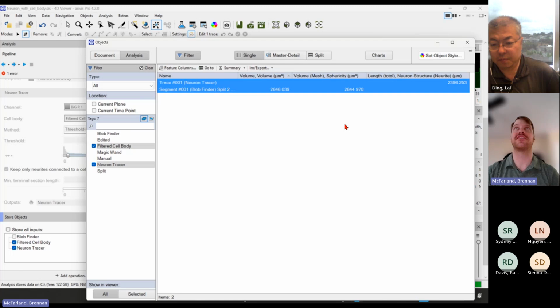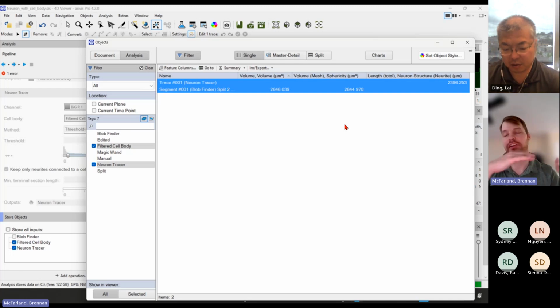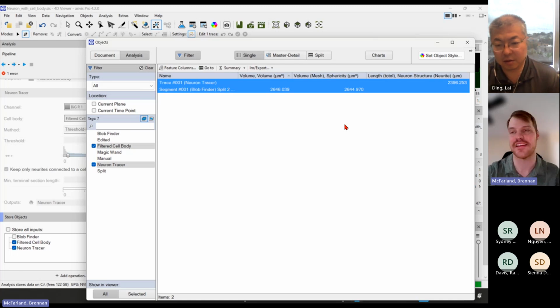And you can have this concatenated. I remember I mentioned Tuesday, if you have experiments like control condition, experiment 1, experiment 2, you can choose to have it all concatenated. So instead of 18 different Excel files, like if there's 6 in each condition, instead of each one having their own Excel file, you can just say, give me a concatenated file. Just makes it easier so you don't have to search through a ton of stuff.